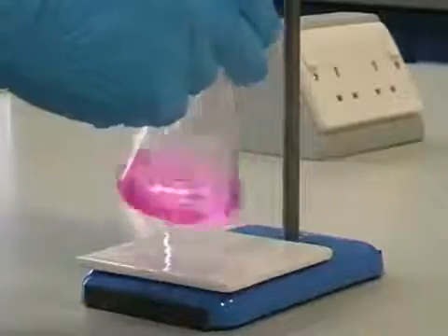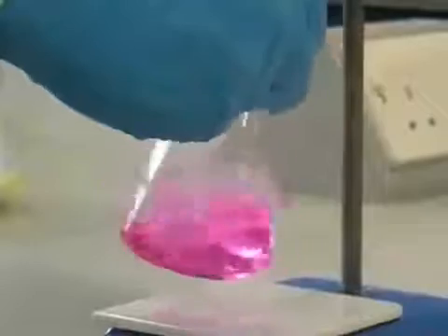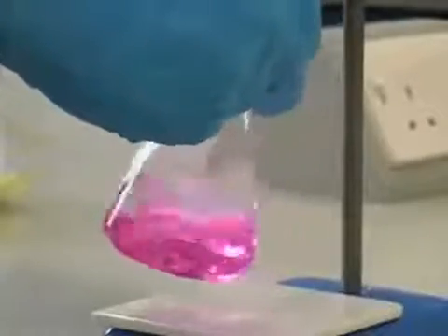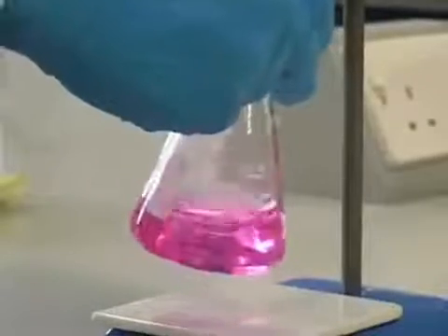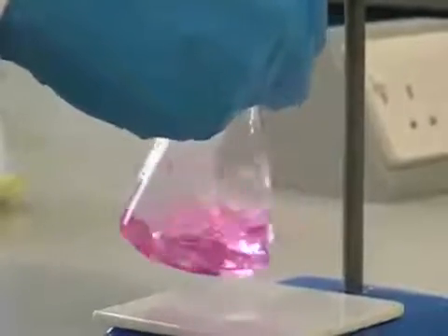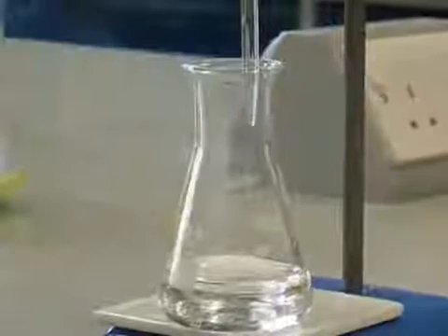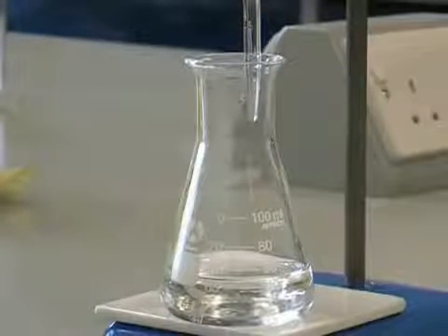And once we've added those 14 centimeters cubed, we can adjust the tap on the burette to add the remaining solution very slowly in a dropwise fashion. This should be continued with regular swirling until the colour has been permanently discharged. Now we can work out accurately how much acid has been added by performing a subtraction, and the experiment should then be repeated until concordant results are obtained.